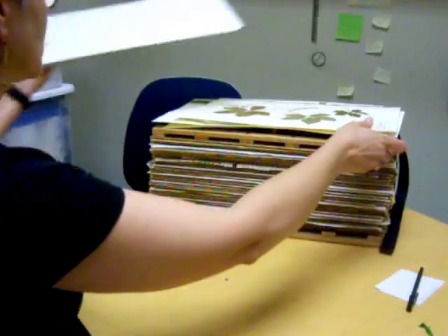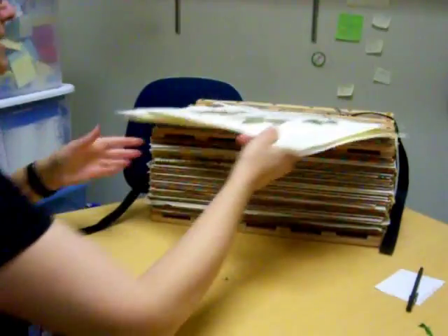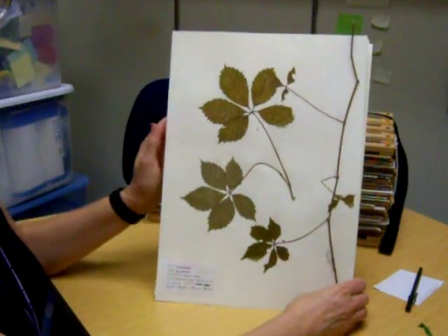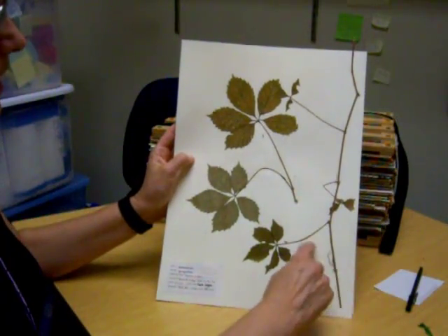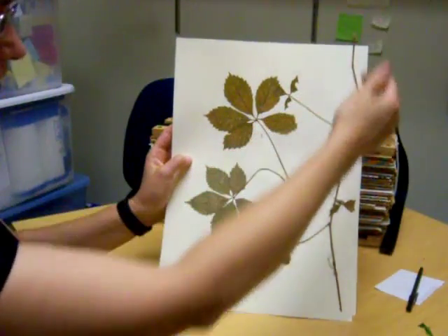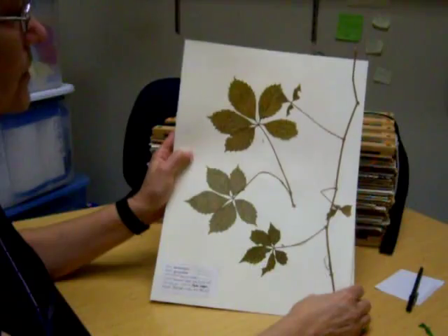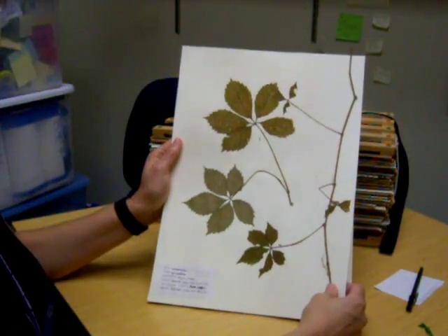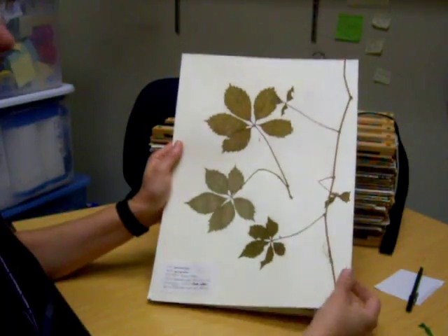Here are some completed examples. This is a bad example because it has two separate pieces. A piece goes off the edge and I don't see any flowers or fruit. So this is not the way you want your specimens to look.